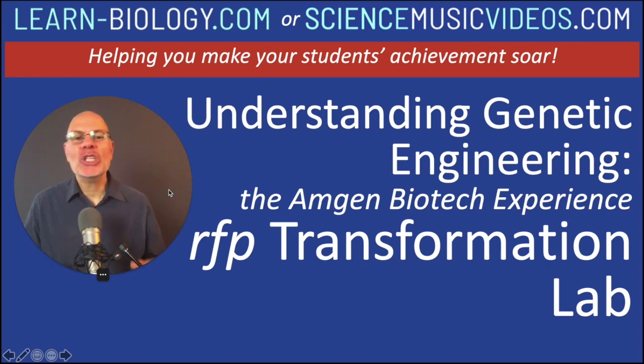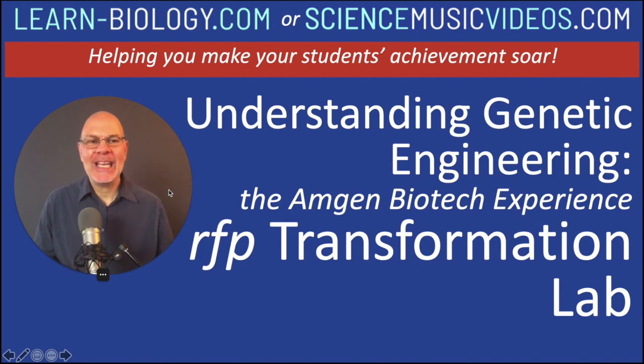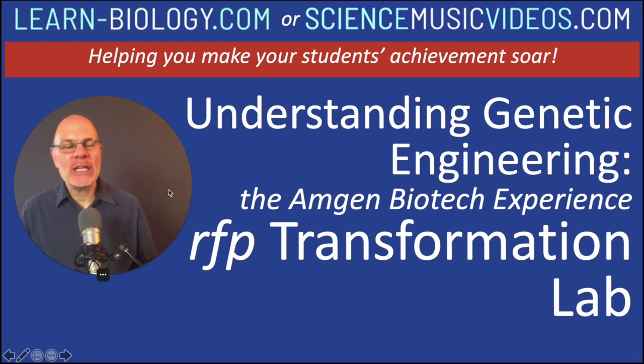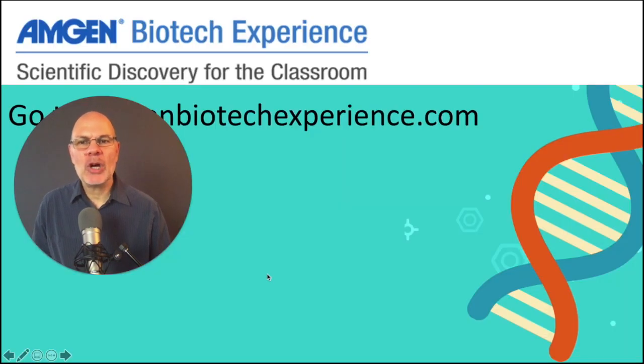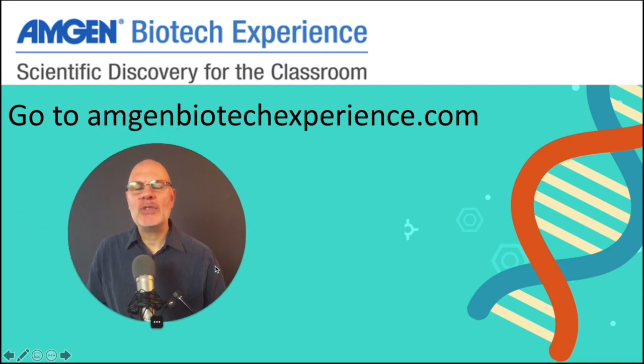This video is called Understanding Genetic Engineering. It's part of the Amgen Biotech experience made by myself and my colleagues at Berkeley High School. And it's an RFP, red fluorescent protein transformation lab. And let's start by talking a little bit about the Amgen Biotech experience.